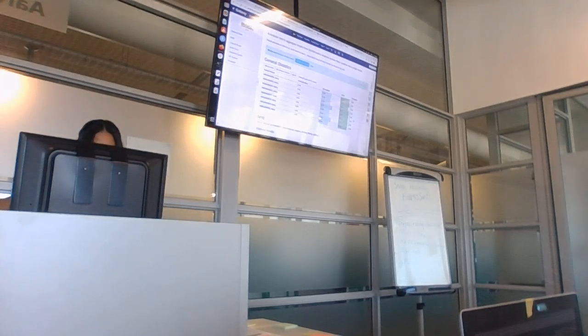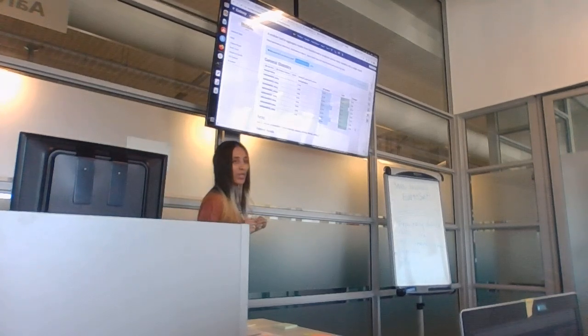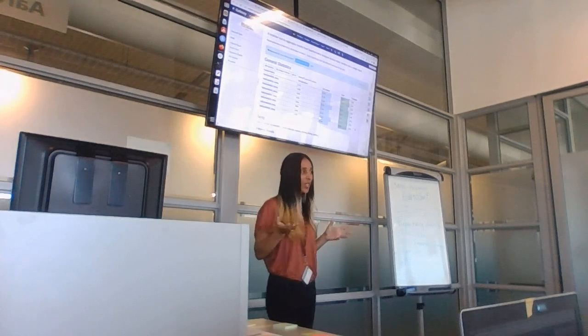The first one. What does it end in? The duplication. It's high, but it's very little, right? Like 0.1, compared to the others. And then the adapter percentage. No, that's still okay, and it can be chopped off. But there's something there that can't be changed. Yes, the GC content.